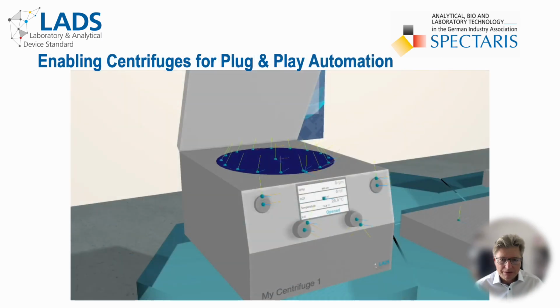While the incubator we have just inspected is one of the few lab devices designed with automation in mind, we will now turn to another typical lab device which is designed for manual operation. A laboratory centrifuge, one of the most common laboratory instruments. Its lid is currently opened, exposing its rotor.